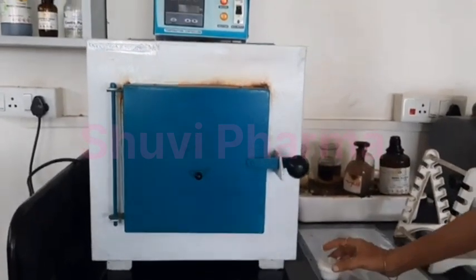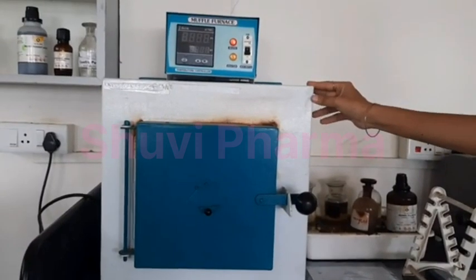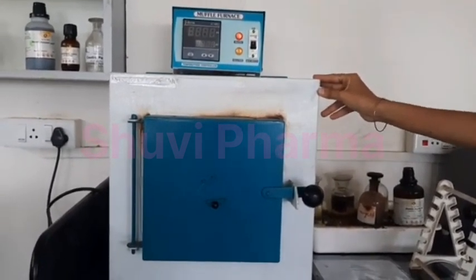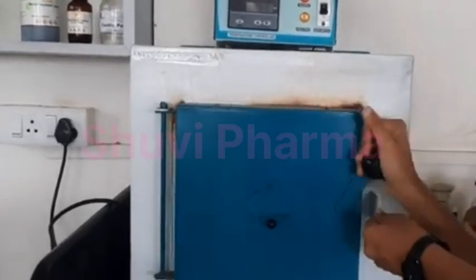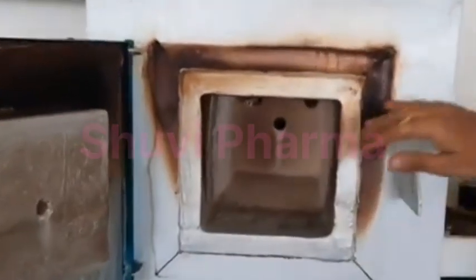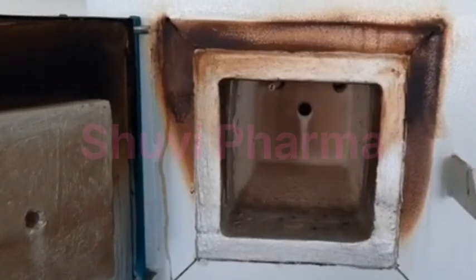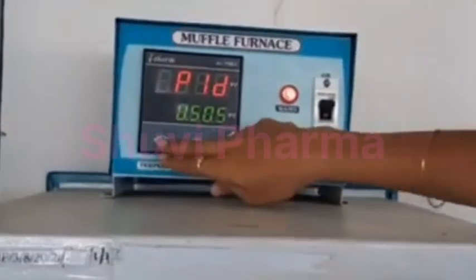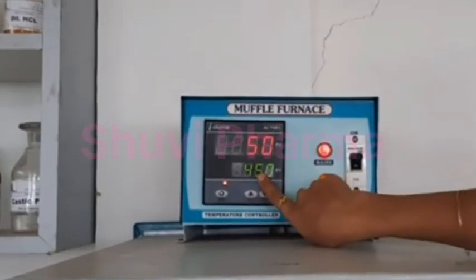Now we will keep this for incineration in a muffle furnace. This instrument is known as a muffle furnace, which is used to determine the ash. Inside this we will keep the crucible which contains the drug, and here we will set the temperature to 450.